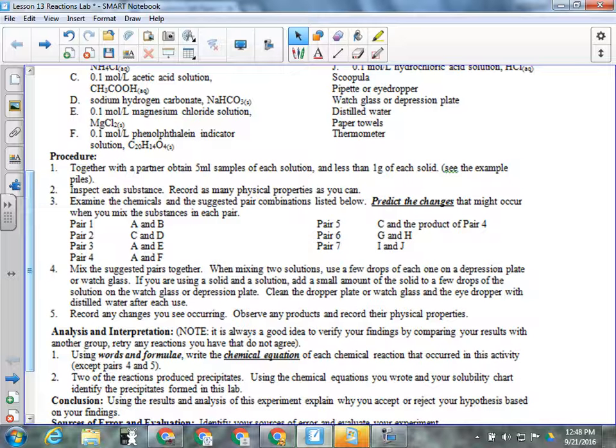I'm telling you that because one of your precipitates that you're going to get is white. And if you have it over the paper, you won't see it. Okay? One of your color changes is to a deep purplish red, and if you have it over the black surface, you might not see it. So just be aware you need to have 2 colors, black and white, in order to see all of the color changes. Some of them, it won't matter where you have it. You're going to see them and they're bright and obvious. But there are 2.